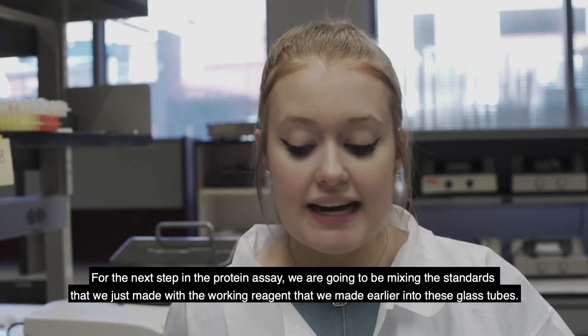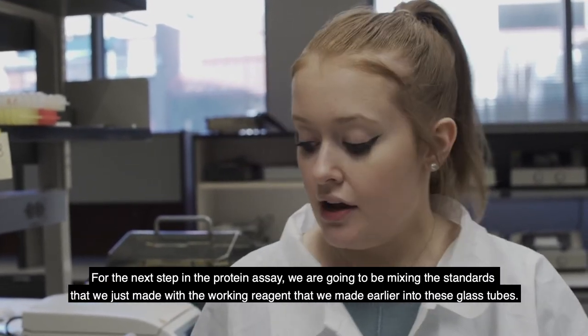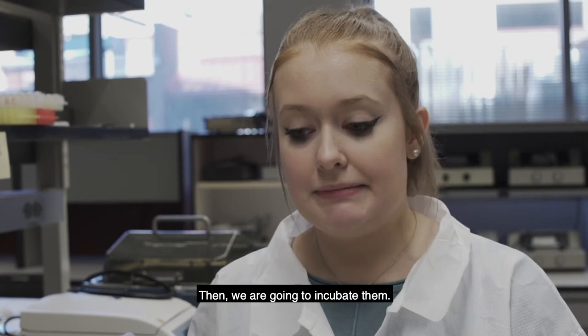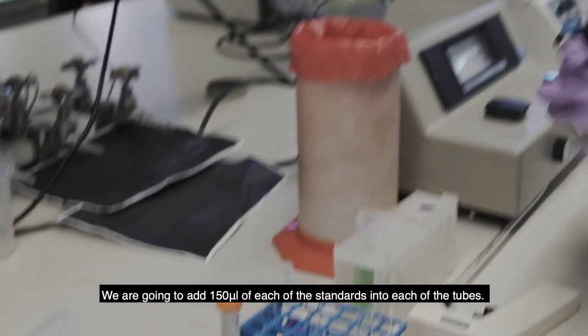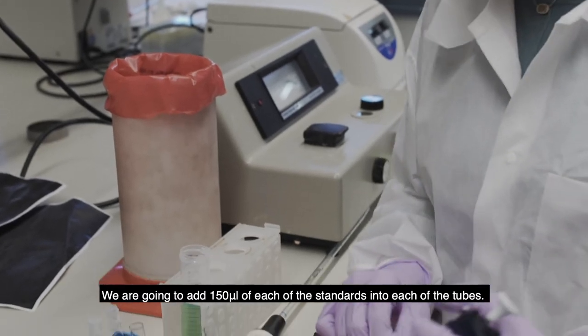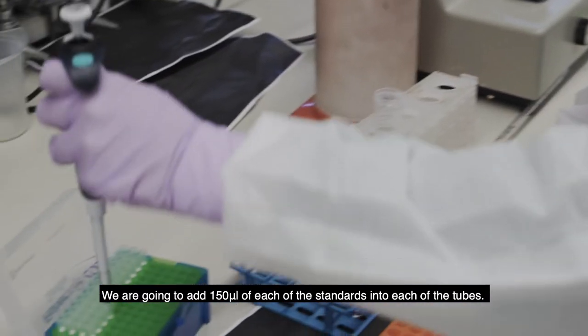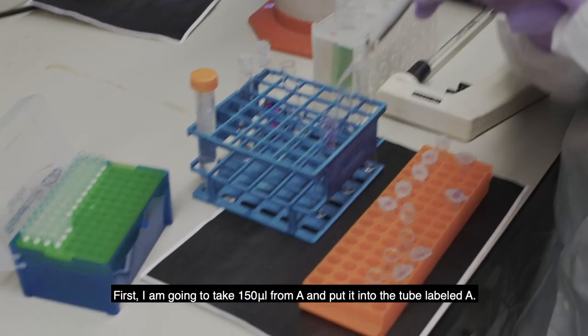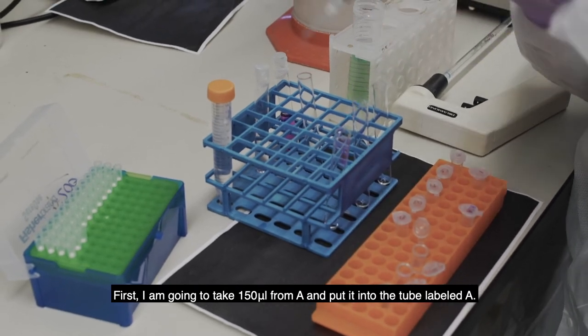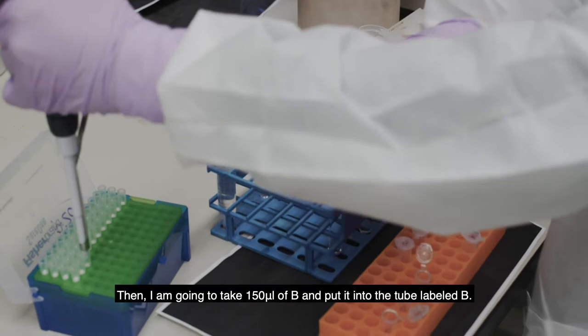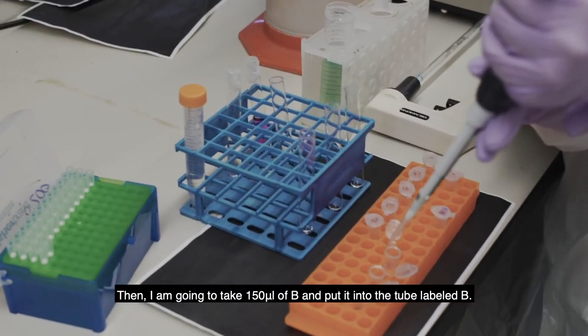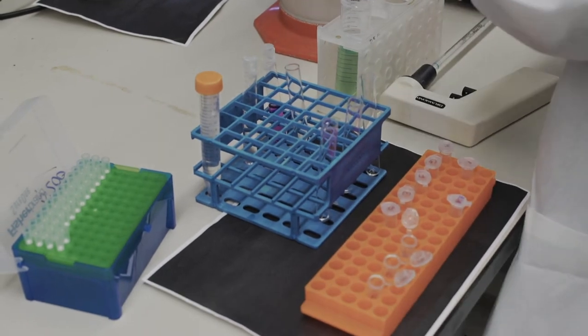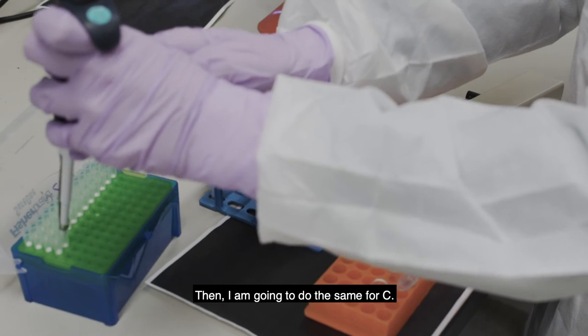So the next step in the protein assay, we're going to be mixing the standards that we just made with the working reagent that we made earlier into these glass tubes, and then we're going to incubate them. We're going to add 150 microliters of each of the standards into each of the tubes. So first I'm going to take 150 microliters from A, and put it into the tube labeled A, and then I'm going to take 150 microliters from B, and then put it into the tube labeled B, and then I'm going to do the same for C. And then now I'm going to take 3 milliliters of our working reagent and put it into the tube.